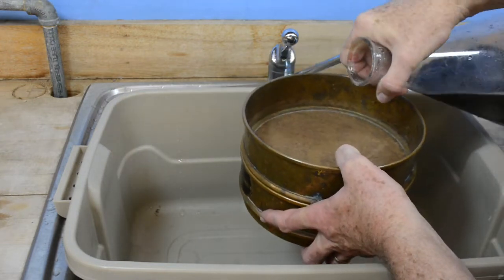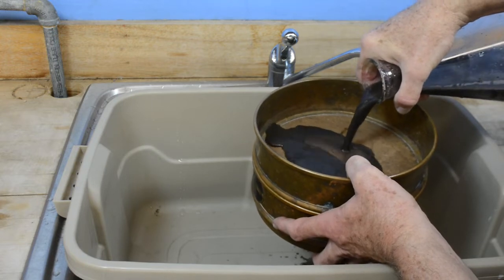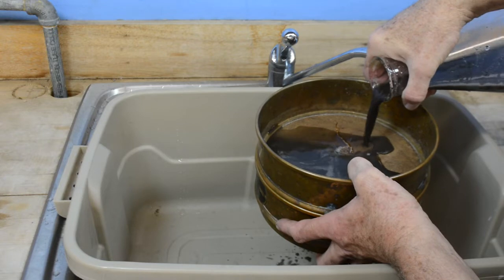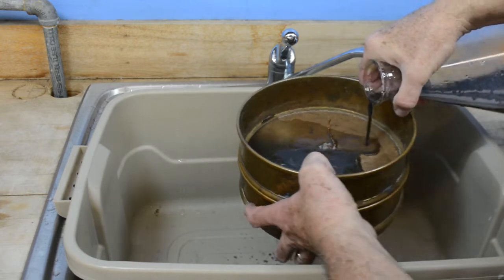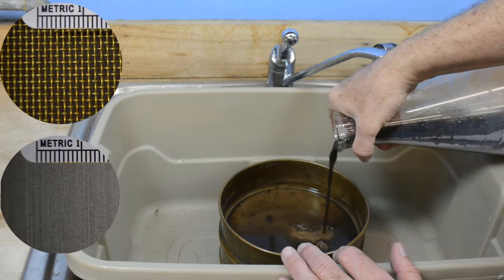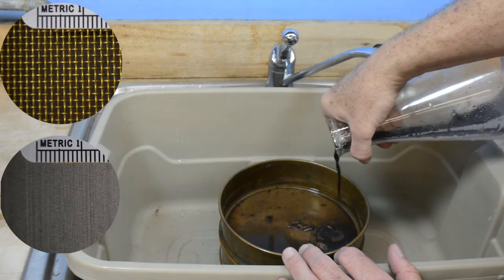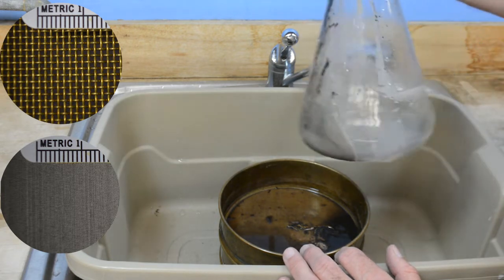I decant the water into this stack of sieves. The upper sieve is 35 mesh, and the lower sieve is a 325 mesh. The larger the number of the sieve, the more openings per inch, and the smaller the opening. Here are a couple of pictures of the mesh — you can see the larger 35 mesh and the very fine mesh of 325.